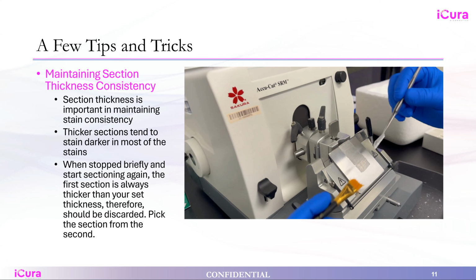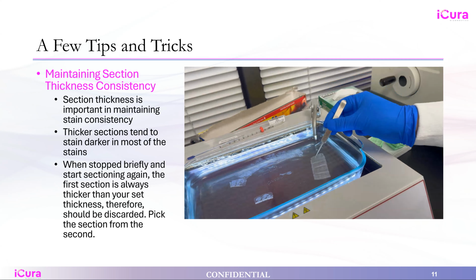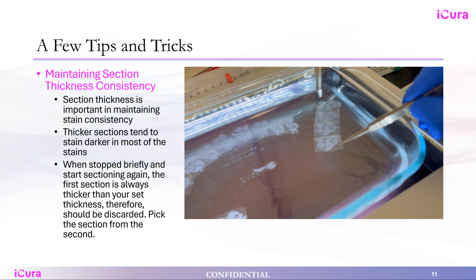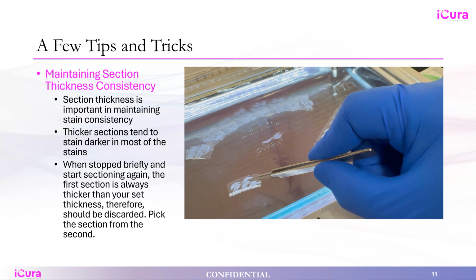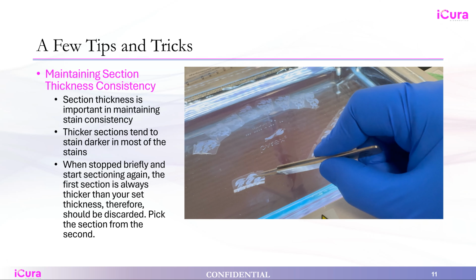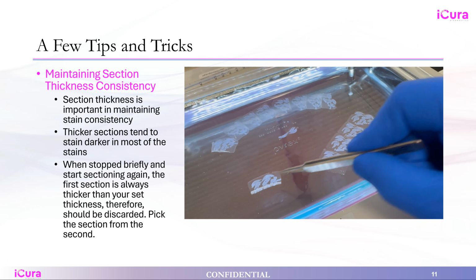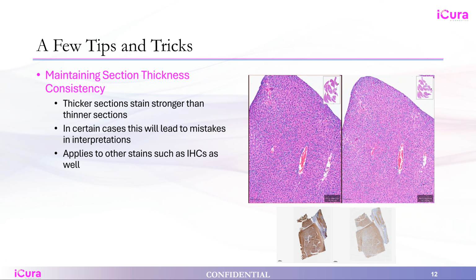We can put this into the water bath, and also the rest of the ribbon. You can see immediately that the sections starting from the second one are much more transparent compared to the first section, meaning that the thickness is different. And this has an impact on your staining results.